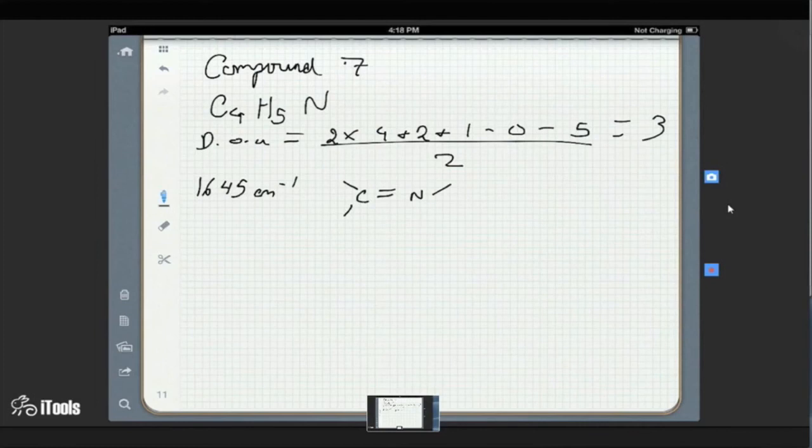Okay, so it's going to be peaks A, B, C, and D. That peak is at what? That peak is like 6? Like 5.8. So that just looks like an alkene. An alkene? Yeah, which is consistent with the one that we have there. So you think that's the C? I do think so, though.